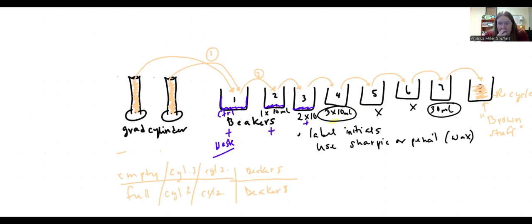That's part A of the experiment. It allows us to test a hypothesis about the graduated cylinder's uncertainty, about transfer loss every time we move material from one container to another, about how many times we have to rinse something for it to really be clean, and then whether 1 big rinse or many small rinses is more effective. So that's 4 hypotheses in part A.